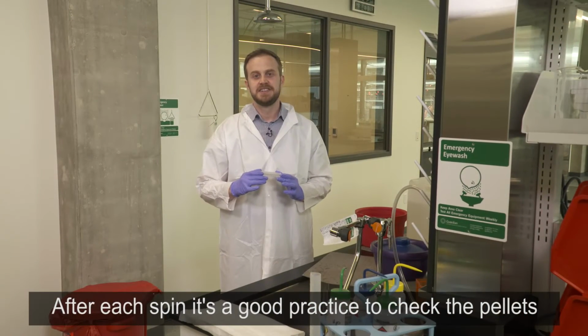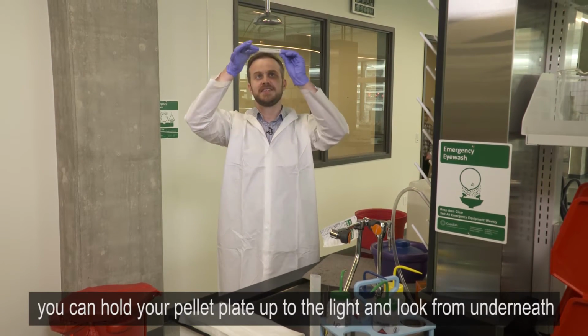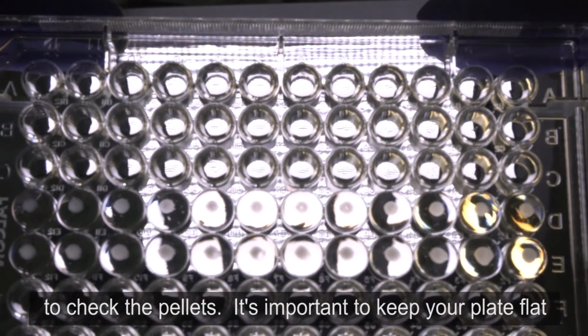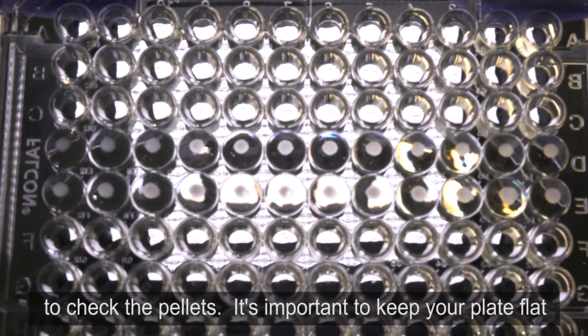After each spin, it's a good practice to check the pellet in the plates. You can hold your plate up to the light and look from underneath to check the pellets. It's important to keep your plate flat while you are checking the pellets.